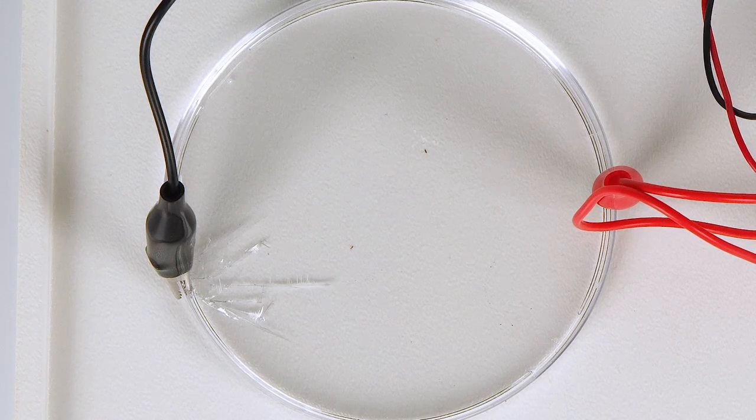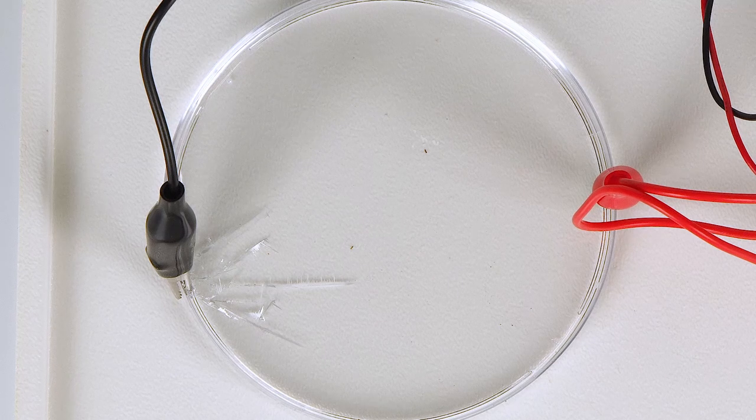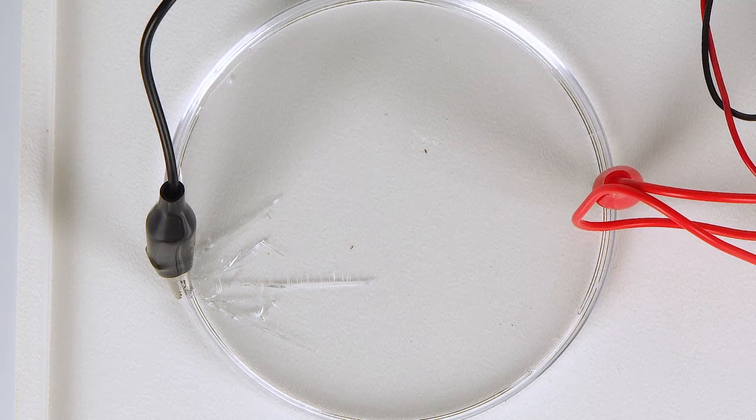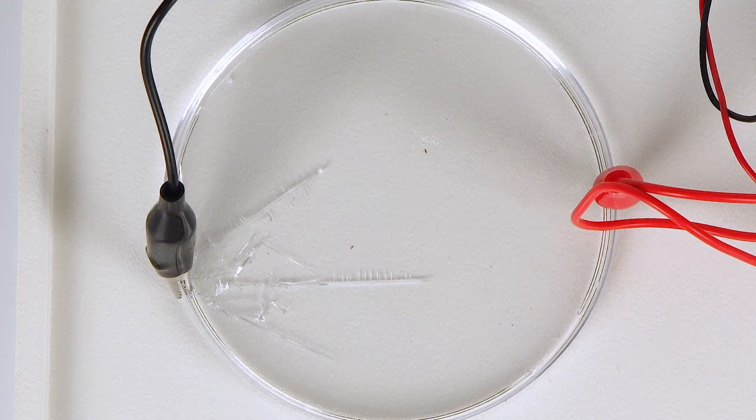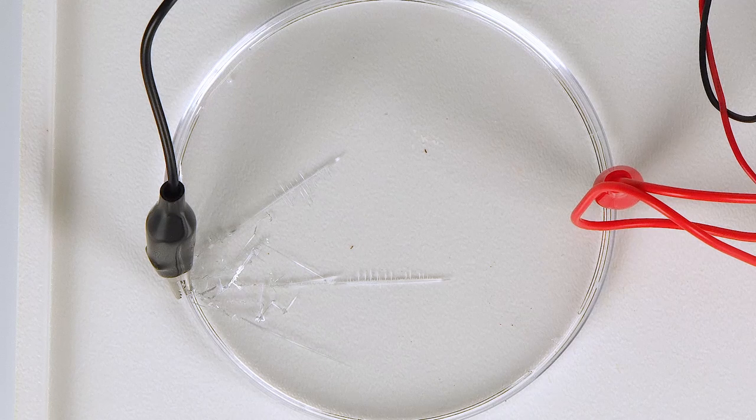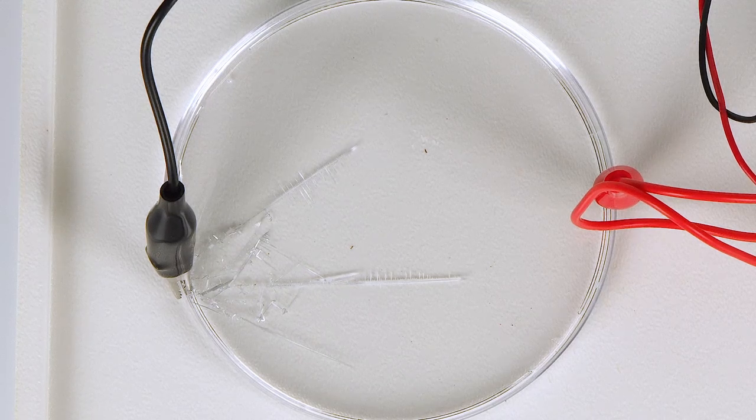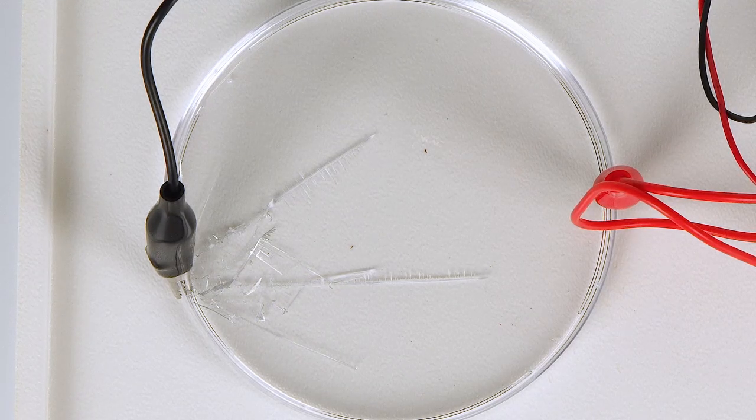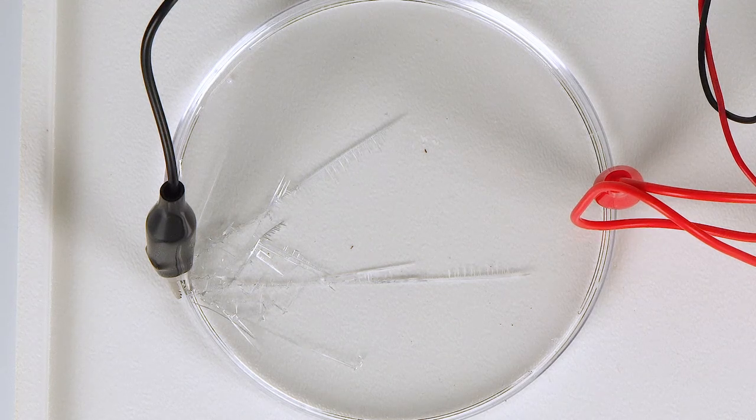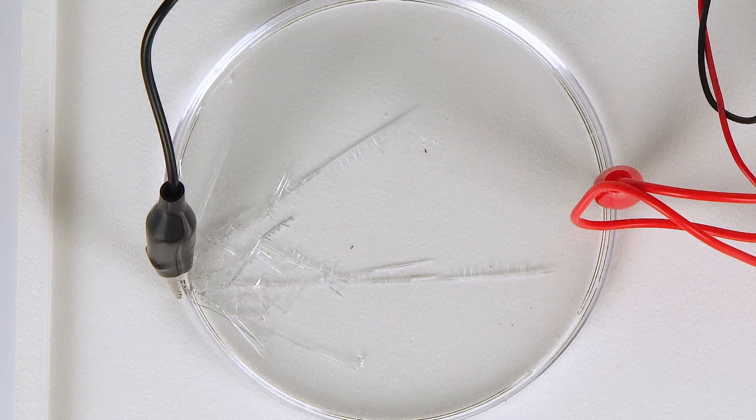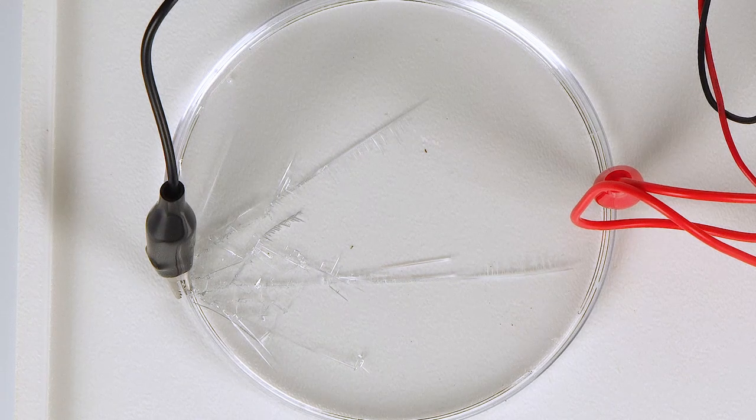When we connect the wires, we close the electric circuit and electric current begins to run through it. The red wire becomes positively charged, while the black one becomes negatively charged, which means that it has an excess of electrons. The excessive electrons from the black wire go to the tin ions in the solution, reducing them to metallic tin, which grows in the petri dish in the form of beautiful dendrites.